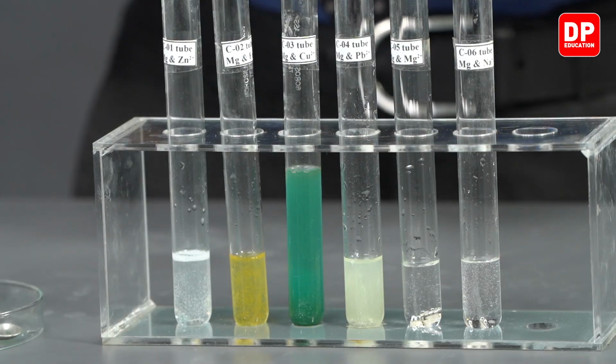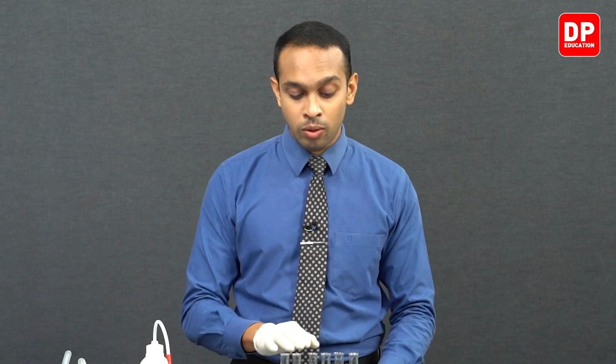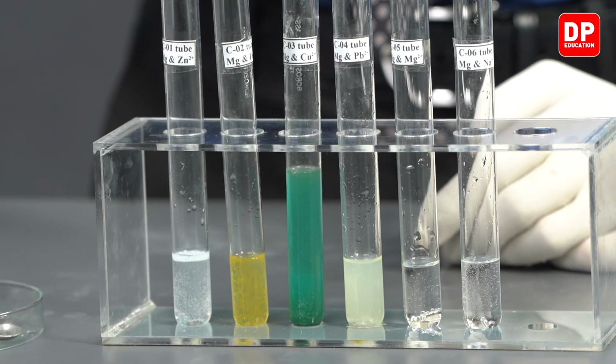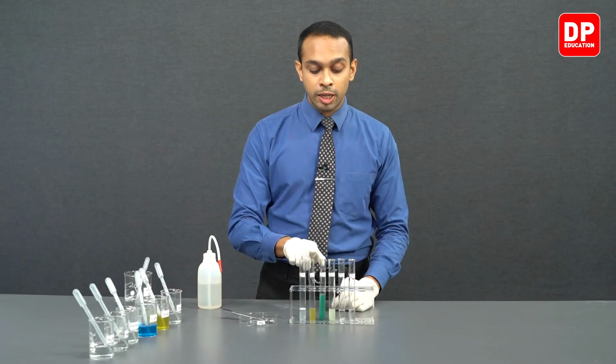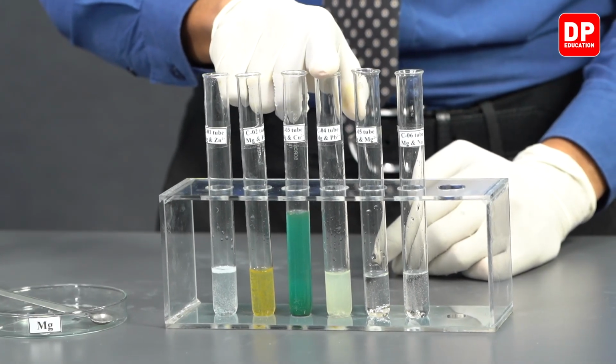So in the electrochemical series as well as in the reactivity series, magnesium is found above lead, meaning magnesium is more reactive than all four of these metals. Magnesium is more reactive than zinc, iron, copper, and lead as well.